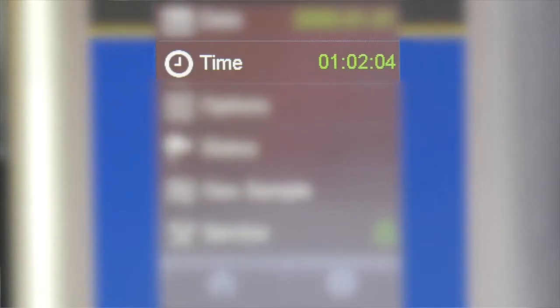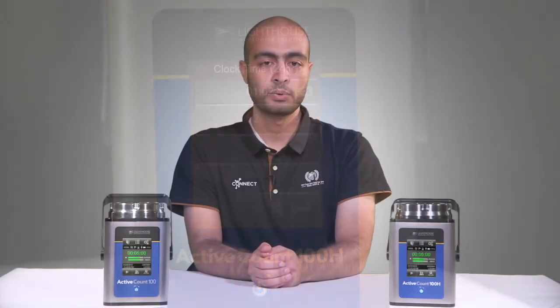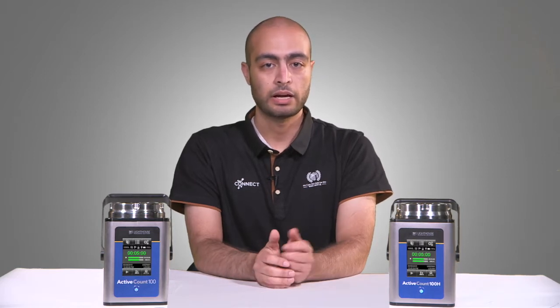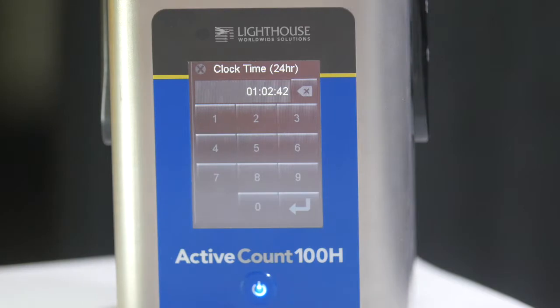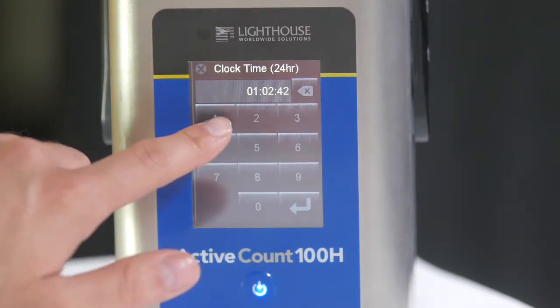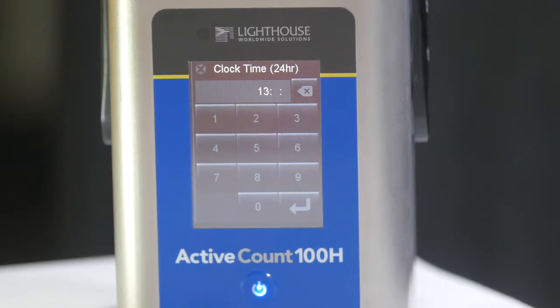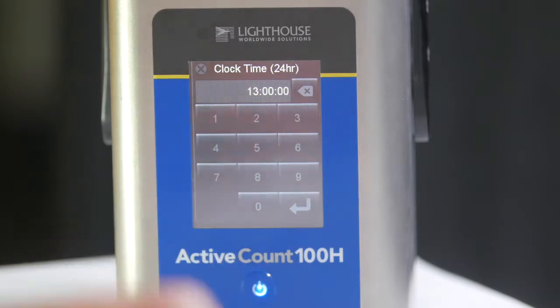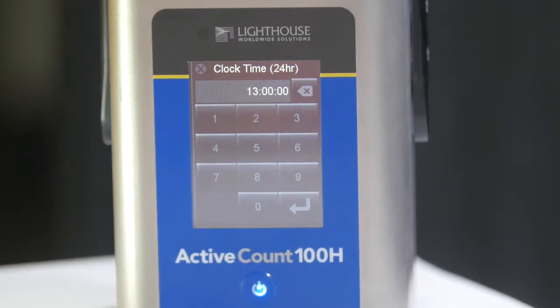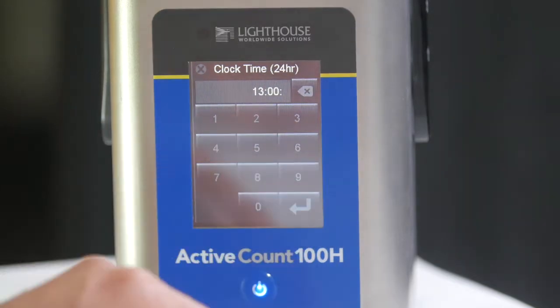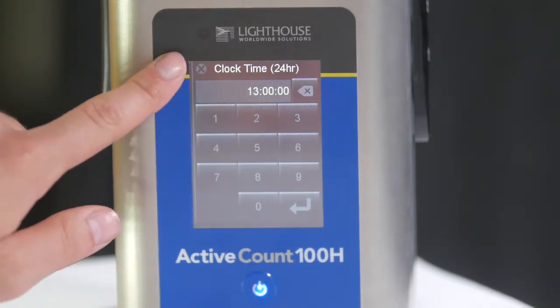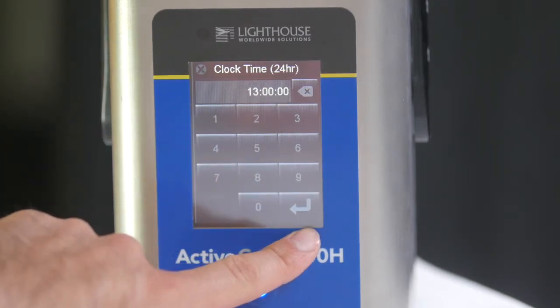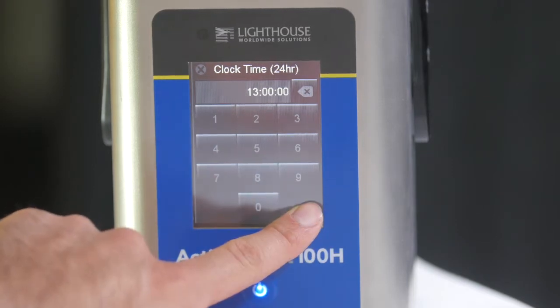Next, we will enter the local time. Always enter the local time in 24-hour format. For example, if your local time is 1 p.m., add 12 hours to that and enter the time as 1,300 hours. Enter two digits for the hours, two digits for the minutes, and two digits for the seconds. We can delete the characters we just typed in by pressing the backspace button. We can cancel out of the screen without saving any changes by pressing the X button, or we can enter the new time by pressing the enter key, which will also take us back to the settings menu.